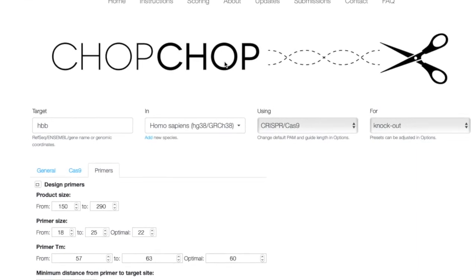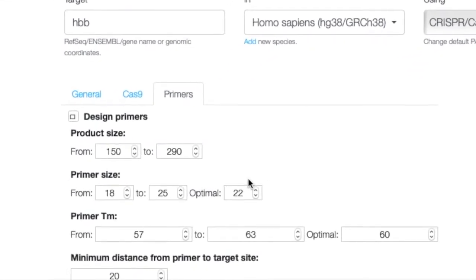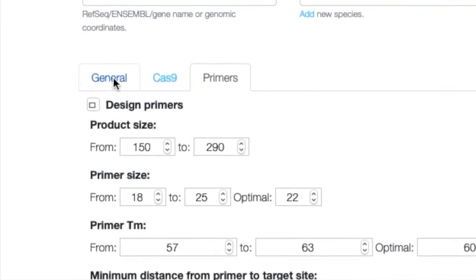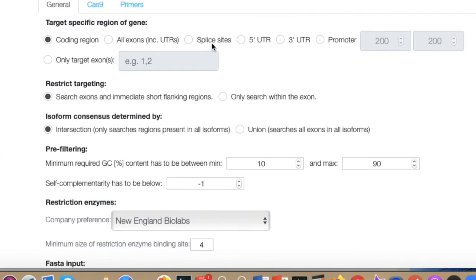In CHOPCHOP's Options tab you can specify where to target. Generally you want coding regions or exons. Targeting 5' or 3' UTRs is not a great idea unless you're specifically studying those regions' effects. For a knockout or knock-in, stick to coding regions. You can also look at particular splice sites, promoters, or untranslated regions depending on your experimental question.